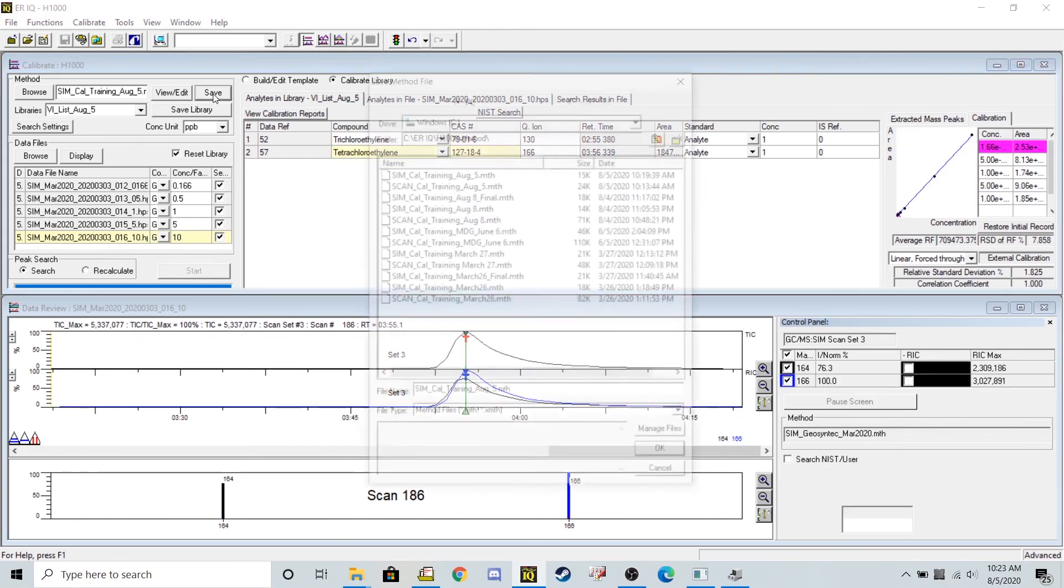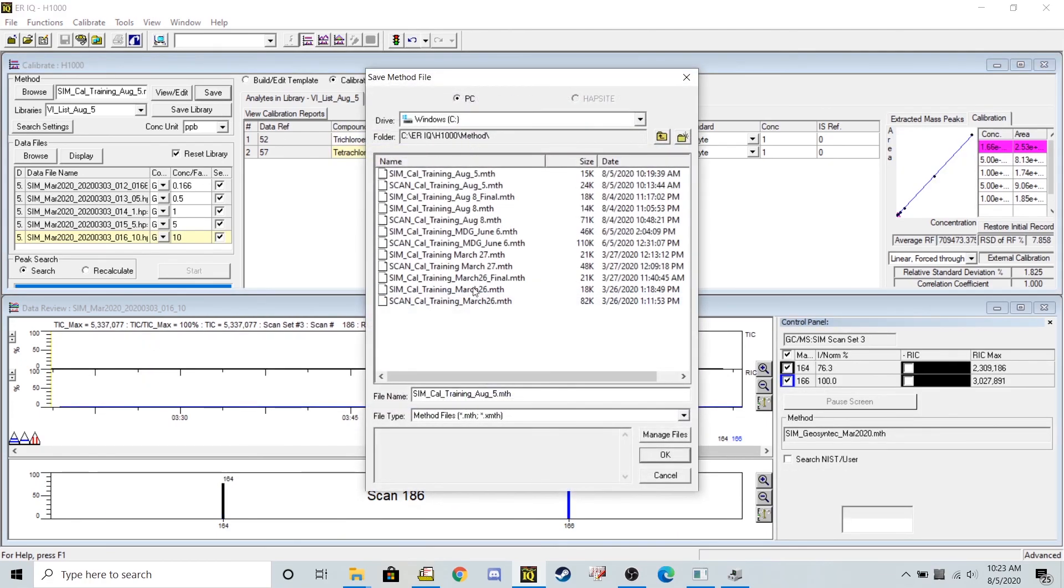I can go ahead and save this brand new method. I'm going to call it SIM cal training August 5th underscore final.